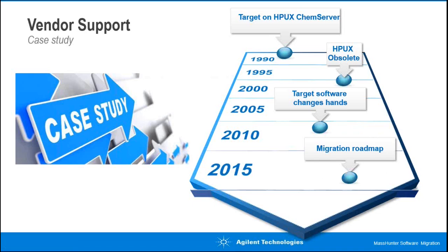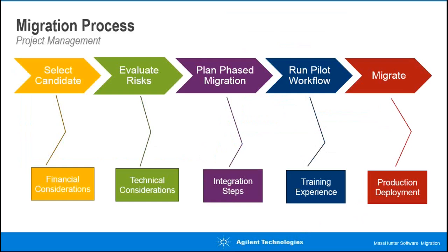There's a number of shops that are still using Target as a case example. Many of them are running Agilent equipment. That was often the basis. Certainly a distinction to be made here is that Target was a multi-vendor solution and to focus on Agilent instrumentation.